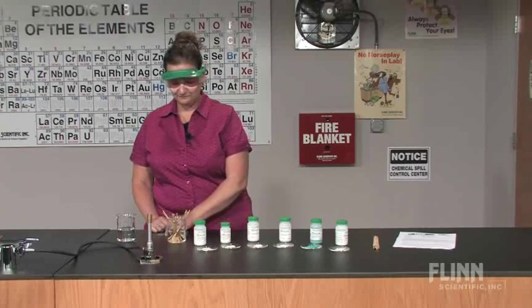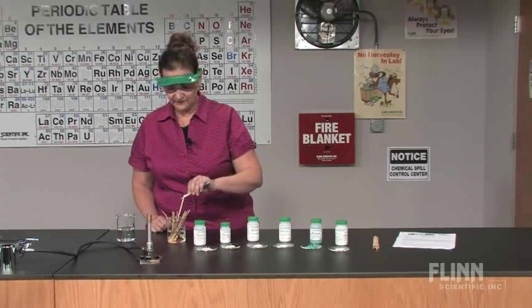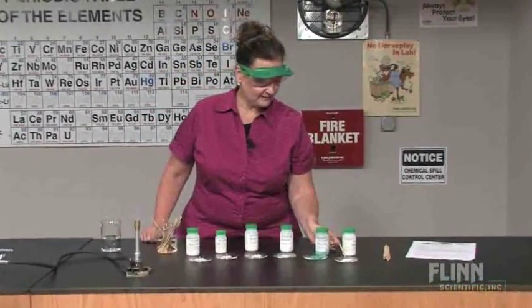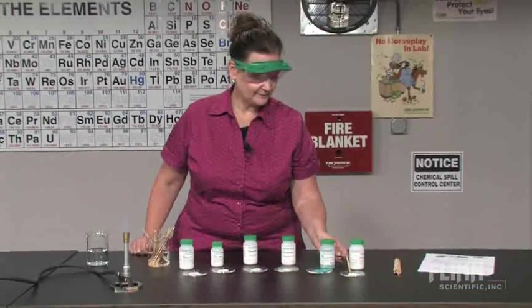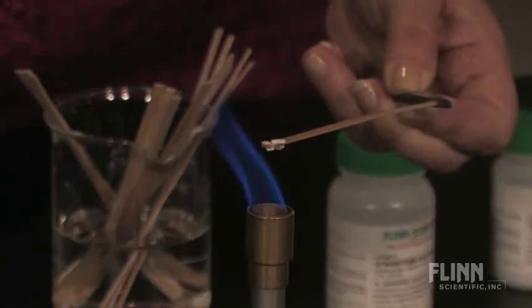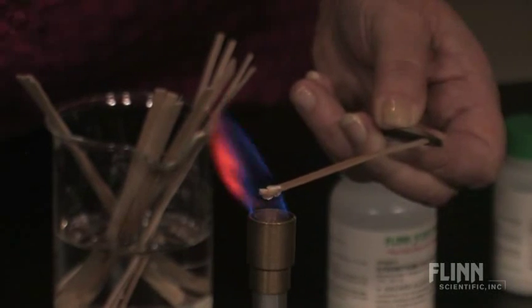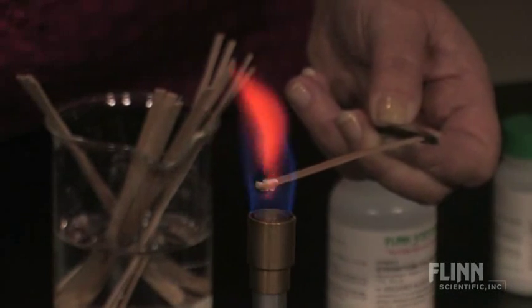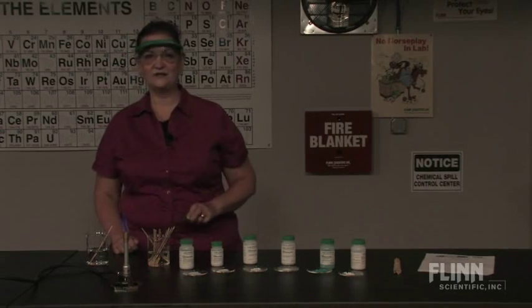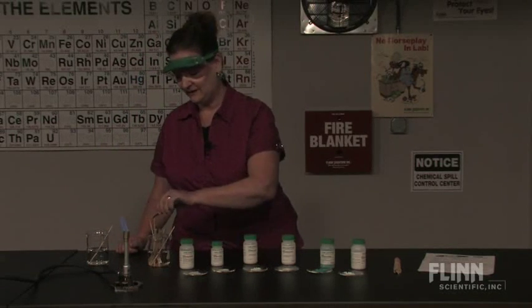Now we're ready for the lab. Students pick up a wood splint from the beaker of distilled water with some forceps and place the moist end into the solid. They then place that in the flame. Here we see the characteristic orange color of calcium. They then place the wood splint in the beaker of water to extinguish the splint. The same procedure is followed for each of the other metal salts.